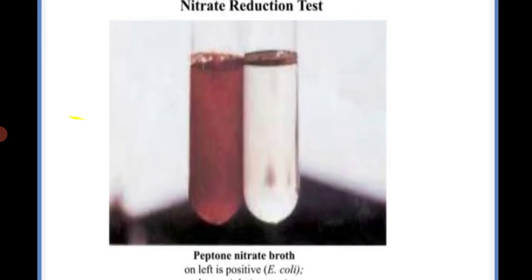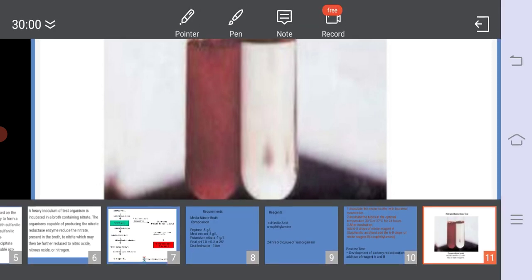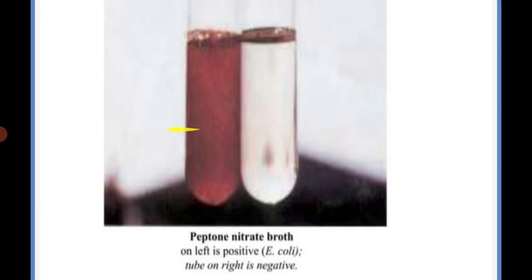Here in this image, the left tube is positive, whereas the right tube is negative.